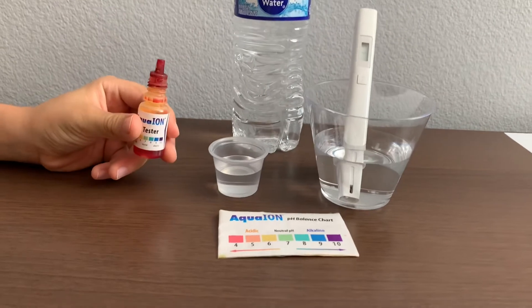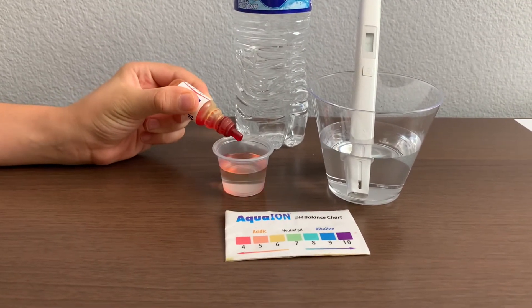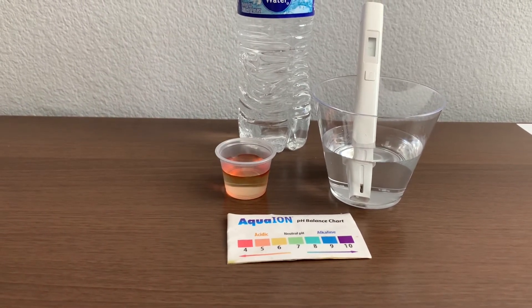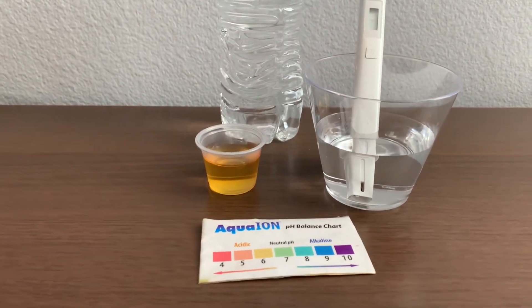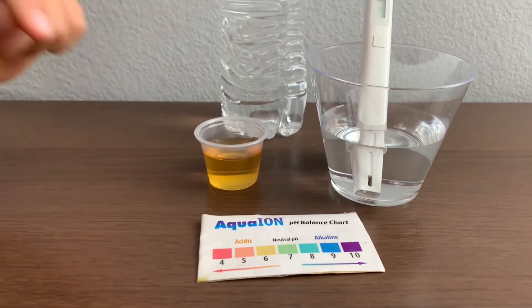Now let's test the pH level. Only do two drops. Let's stir it a little for a better result. I give this a six — this is acidic.